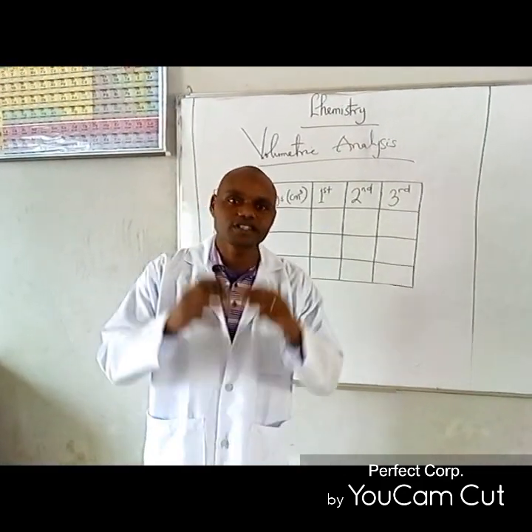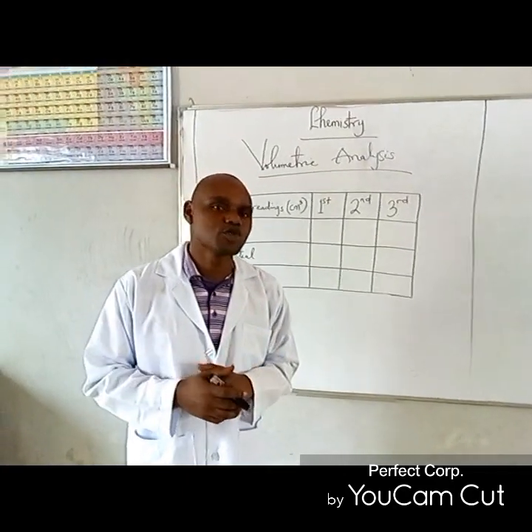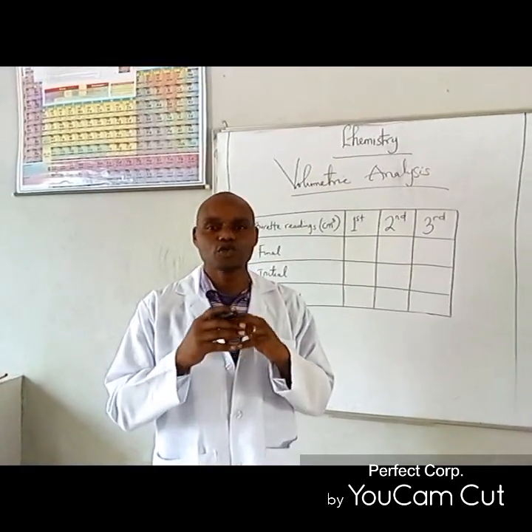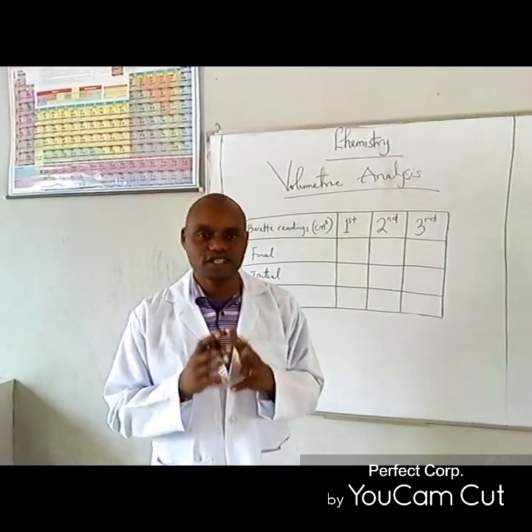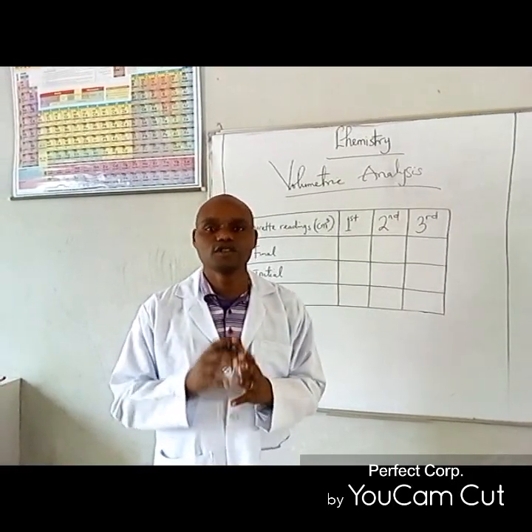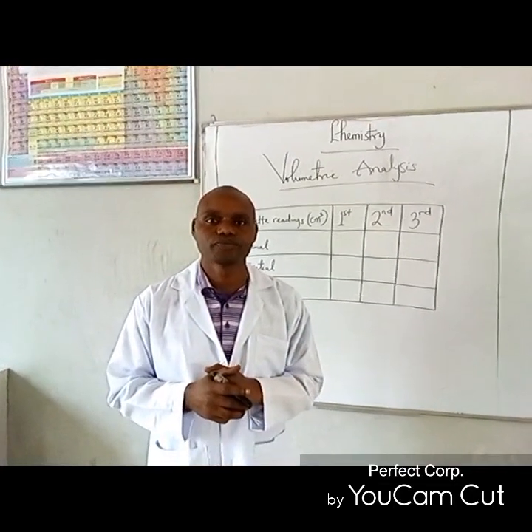Today we want to talk about volumetric analysis. In this practical, I'm going to help chemistry students to understand various ways that they can carry out acid-base titration effectively. So please just follow through as we carry out this practical.